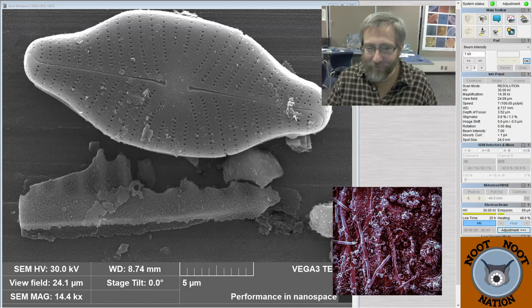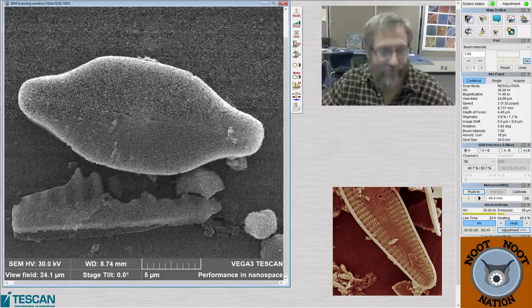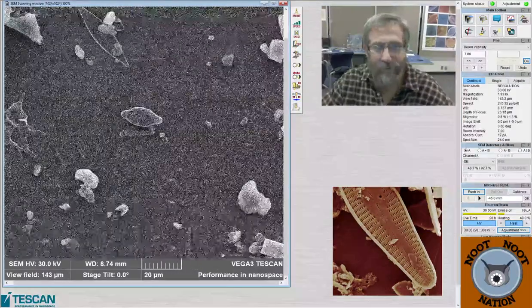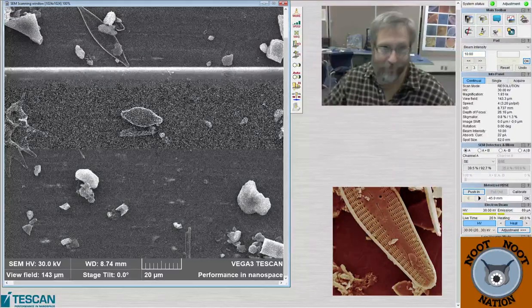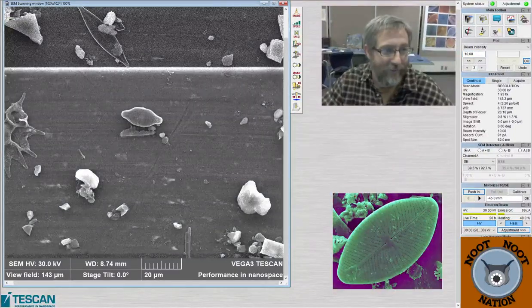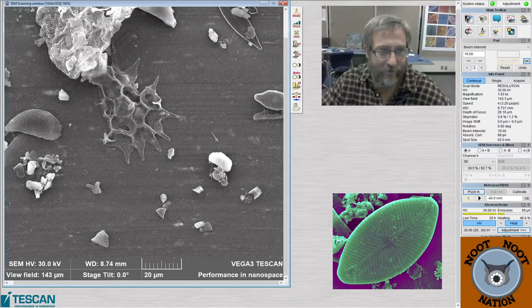Salophoroid. So I'm calling it Salophoroid. We find out it's a Salophora, and then you gave me a bunch of grief about it. Then what? Look at that. Oh, it's only part of the pediastrum.